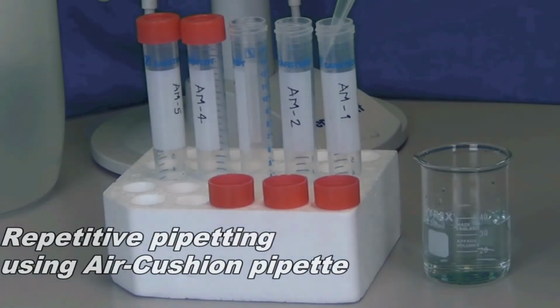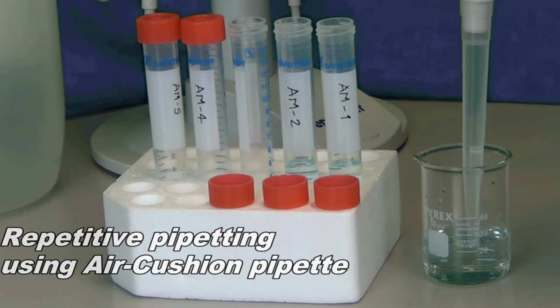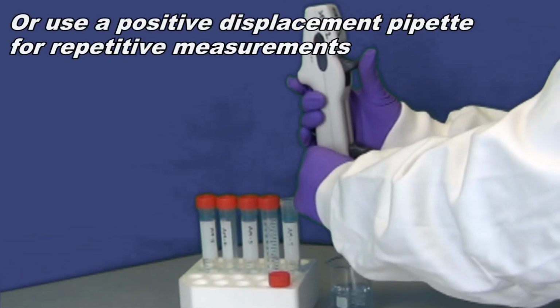Repetitive pipetting. Use the reverse technique to pipette the same solution and volume repeatedly without changing the pipette tip, or use a positive displacement pipette instead.